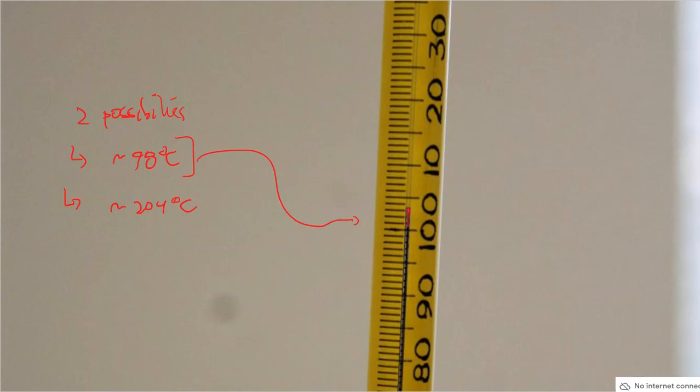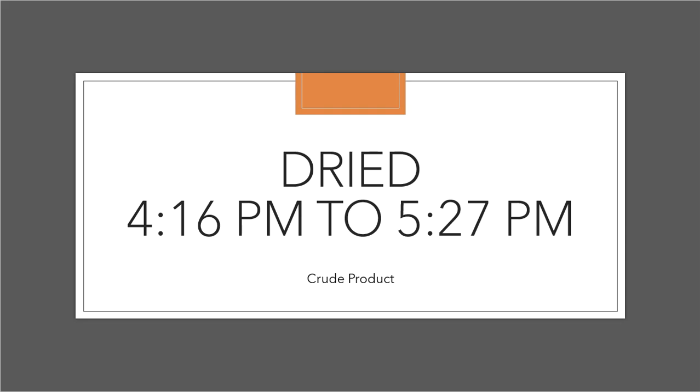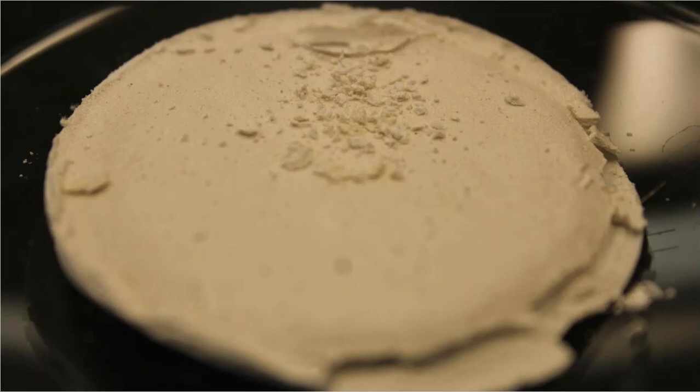If not, what would have happened is I would have had to let this product dry on my lab bench for a couple of days and then come back to it after the water has completely dried out. I didn't want to do that, right? So I wanted to speed this process up. So I kept it in the oven 4:16 to 5:27 p.m. All right, so that's a little over an hour this time, just to make sure that all the water was driven off. I take it out of the oven, and this is what I see, close-up-wise.